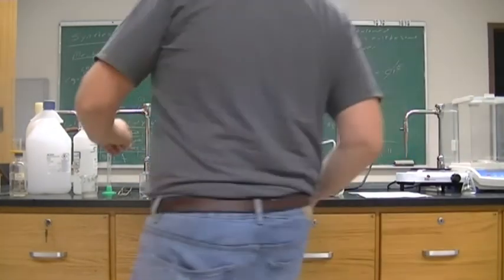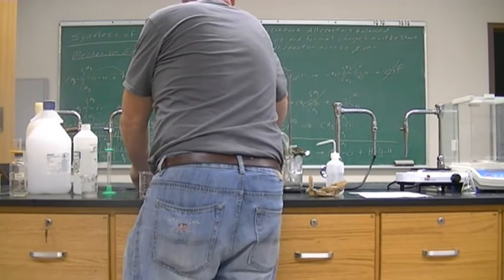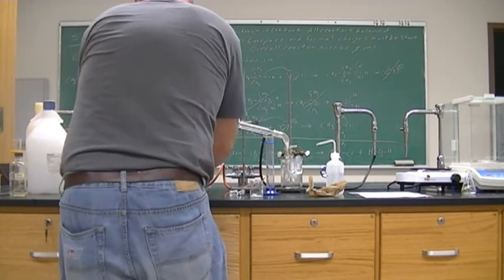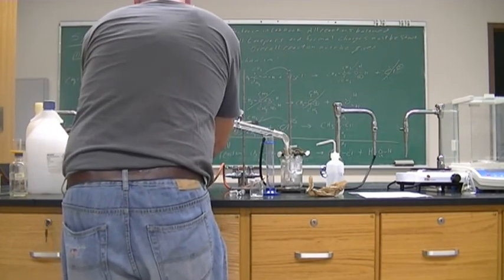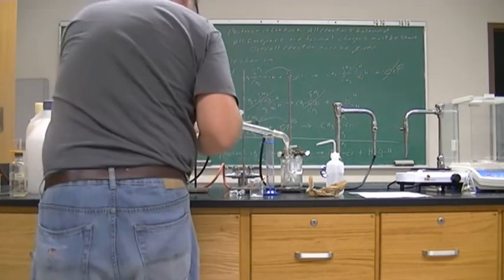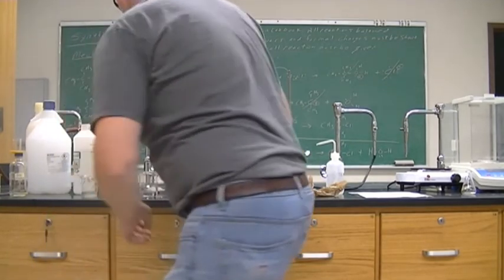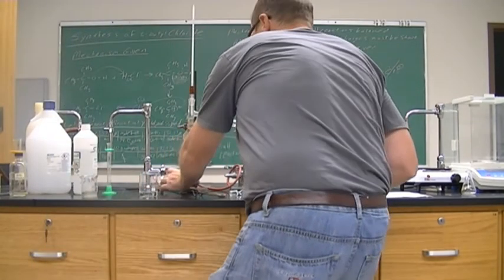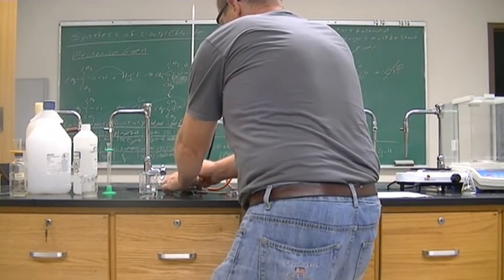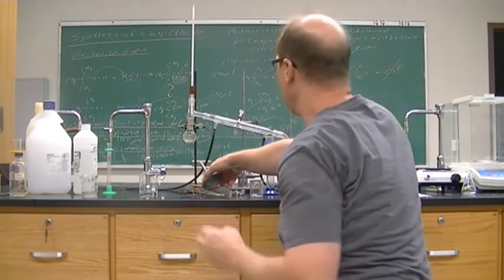We'll light the Bunsen burner, turn on the gas here, got it closed here. Okay, air holes are opened. Turn this down a little bit. And again, you can hold the Bunsen burner, it's not going to get hot.